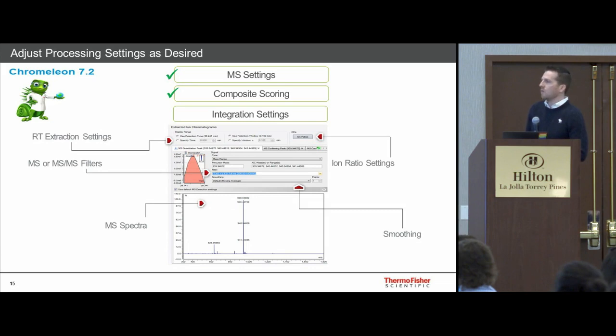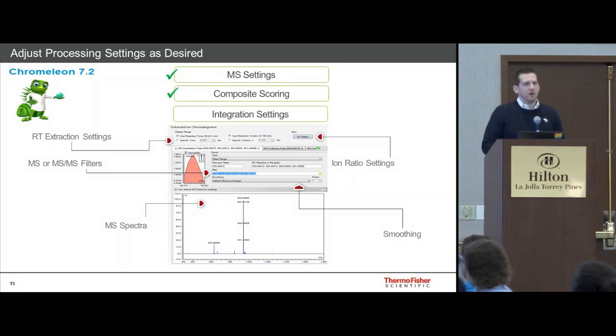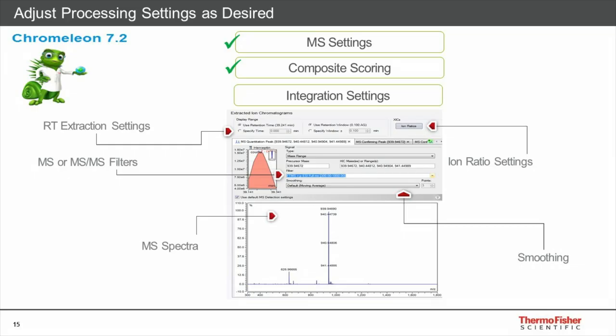So you can say, I want to do a split peak integration just for this peptide. Why would you need to do that? What happens if you have 2 structural isomers, say PENNK? You could have deamidation on one or another, and there's actually a third asparagine as well. If it doesn't completely resolve all 3 distinctly, you'll have a split peak. How do you tell the software ahead of time, get me the left-hand feature, get me the right-hand feature? You can program this ahead of time to do it automatically.